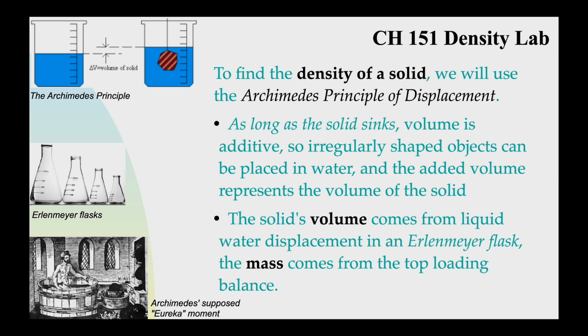Solids don't have flexible shapes. Their volume is very set. So like you can see up there the picture of the metal being placed in the water. So what people usually use is what's called Archimedes' principle of displacement, or just the displacement method. And this comes from the fact that Archimedes was given a task, supposedly by a king, to figure out if substances were real gold or fake gold.